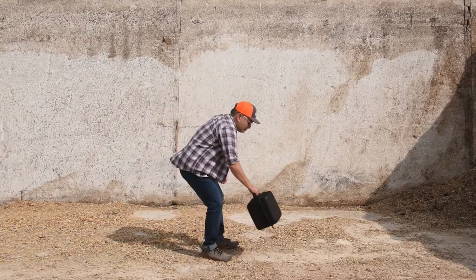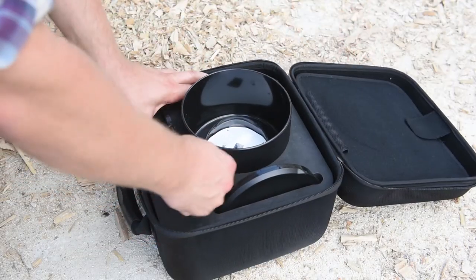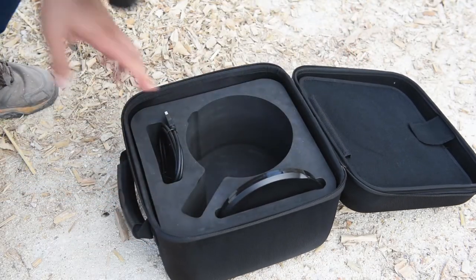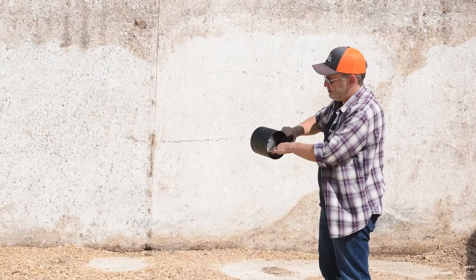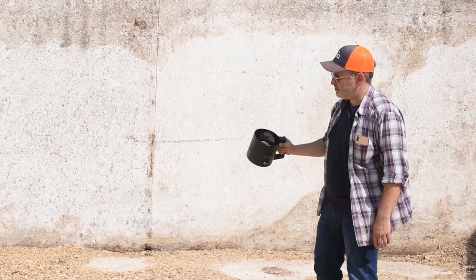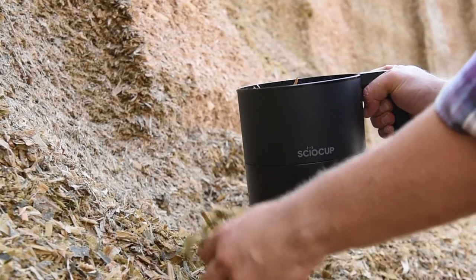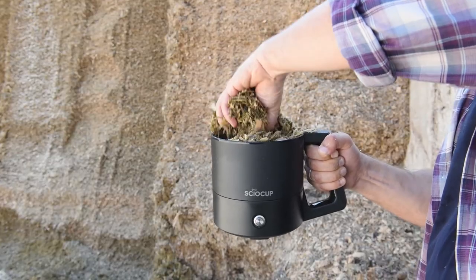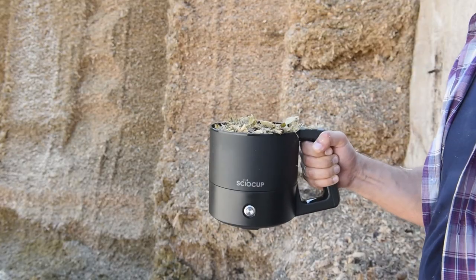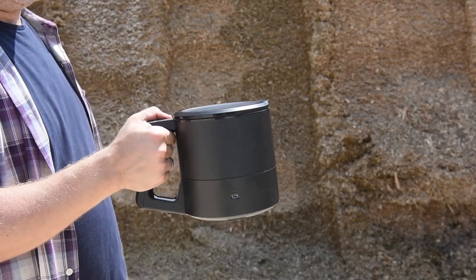Now let's see how to measure forage dry matter. Make sure the cup is clean and empty of any leftovers from previous scans. Take a representative sample of the forage you'd like to scan. Fill the cup to its brim and give the sample a good mix. If you're scanning under direct sunlight, use the lid when scanning.